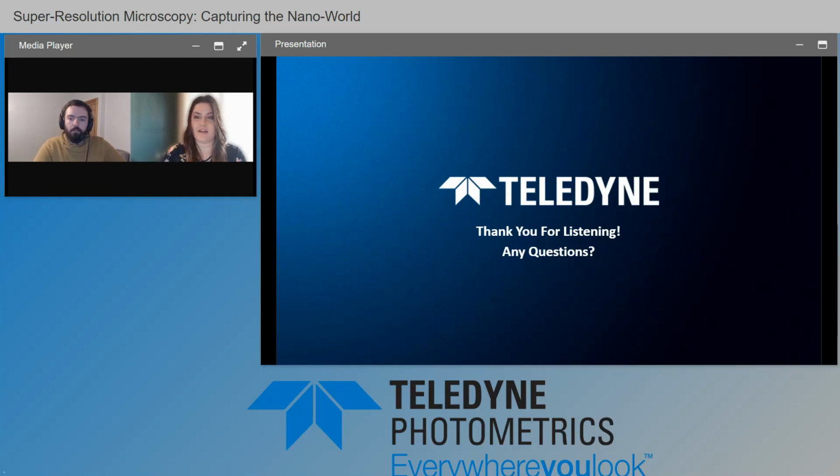Excellent, well said. All right, our next question here, the question says, this technology, can it also be used with immunofluorescence?